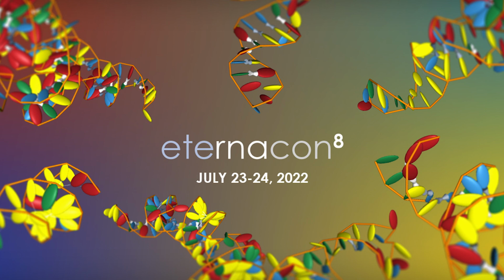Those are more useful because you can undo them. Making actual changes is awkward because those things are gone, and you'll probably want to do more than one kind of detailed investigation. And the focus command will just zoom in without making any change, on a particular base or series of bases, so that's also very useful.